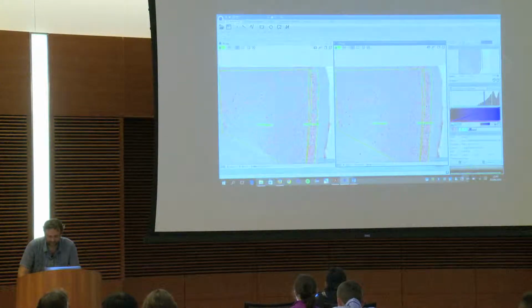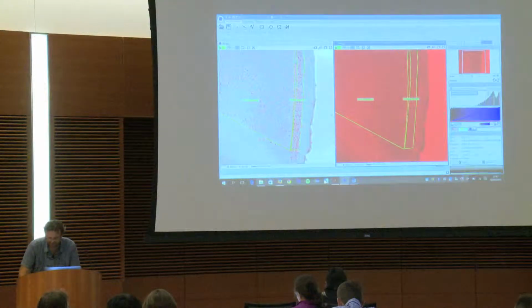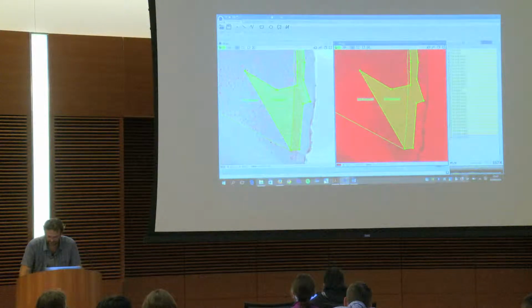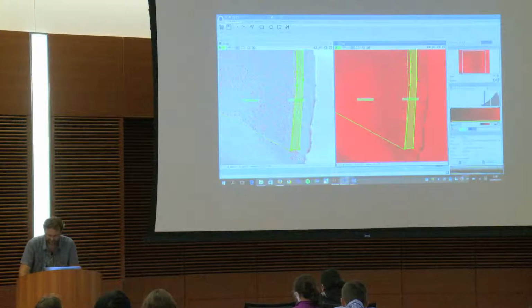Or if I want to create my ROI on a specific channel because I have better eyes in red, but I'm sorry, my example is completely wrong, you could do this and then play with this thing. And this would affect, whoops, the other ROI. Oh, by the way, if I mess up, I go to the history, and then I can go back to the point I want. But it's not only for the ROI. It works for a lot of different things.